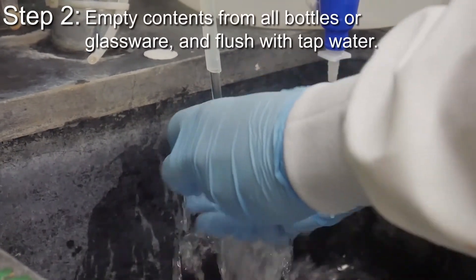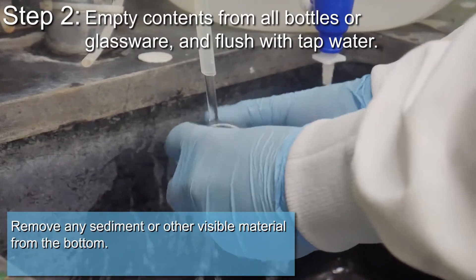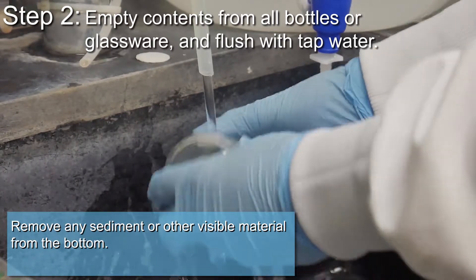Empty contents from all bottles or glassware and flush with tap water. Remove any sediment or other visible material from the bottom.